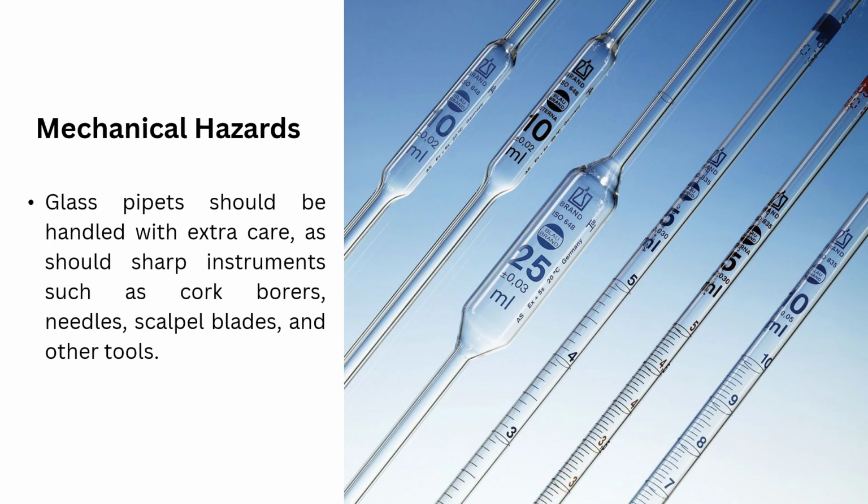All infectious sharps must be disposed in OSHA-approved containers to reduce the risk of injury and infection.